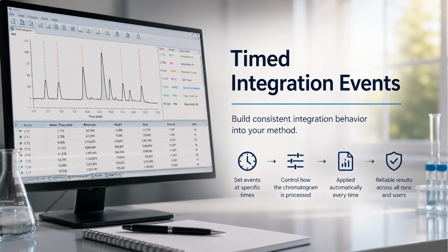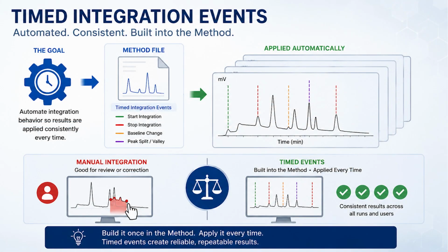In this video, we are going to look at timed integration events in Chromperfect. Chromperfect has been designed to automate as much of the chromatographic process as possible. For that reason, we generally encourage users to rely on method-based integration tools wherever possible, rather than making repeated manual integration changes to individual chromatograms.